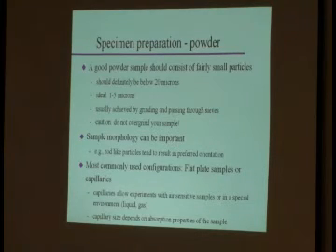You want pretty small particles, okay? And what does that mean? If you have a powder that has particles that are bigger than 20 microns, go grind. Okay? It's not a good powder sample. Something where you want to look for a specialized diffractometer and do single crystal studies. That's at least my opinion. Ideal powders are about 1 to 5 microns.